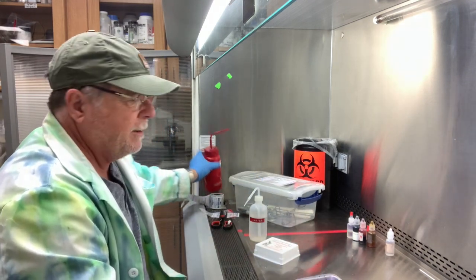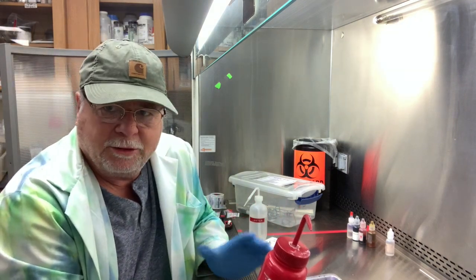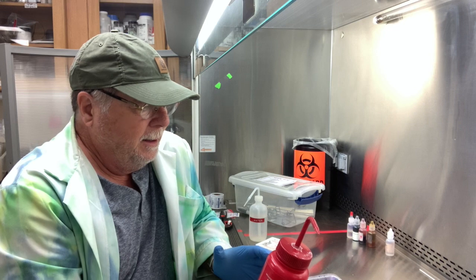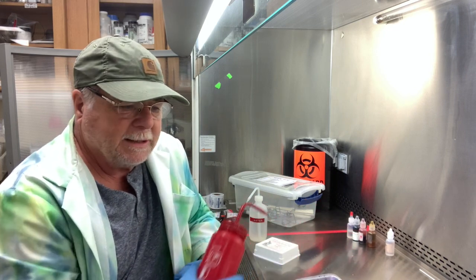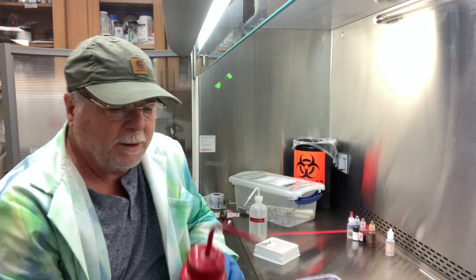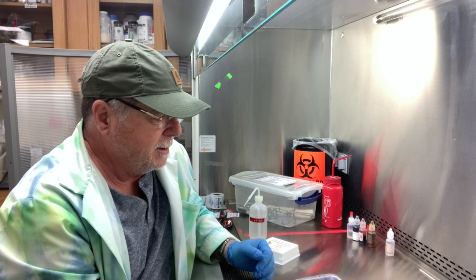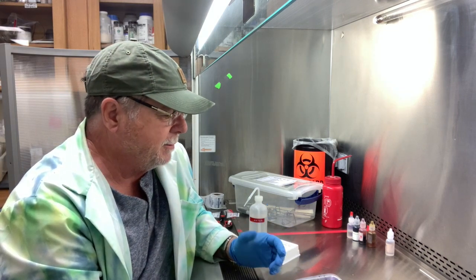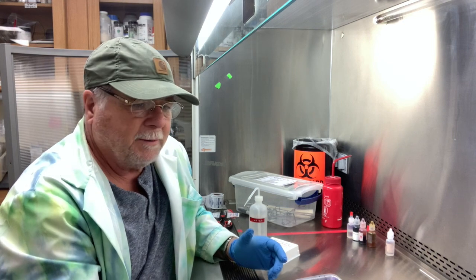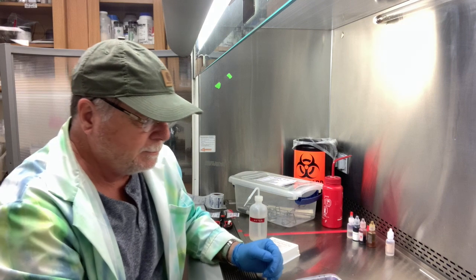Okay, I've already Virexed my area. Before you work with bacteria, you need to wash your hands, put gloves on, and Virex the surface. You don't want to wipe it dry, you just want to wash it, and then you can work on your bacteria. After you're done, you should Virex the area, disinfect it, and then wash your hands last thing.